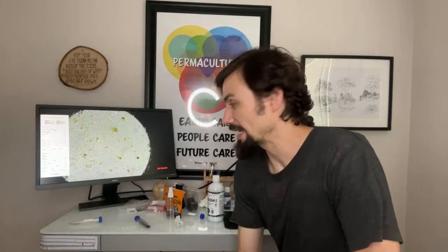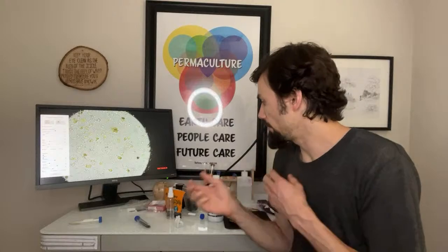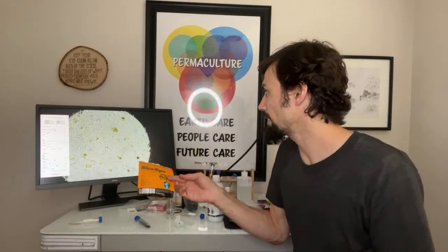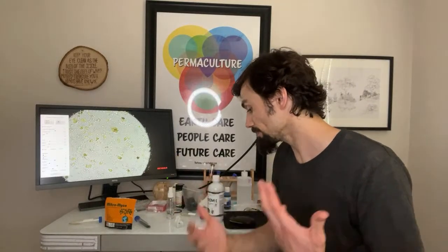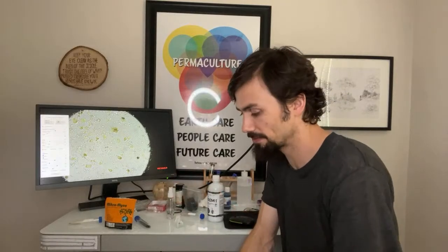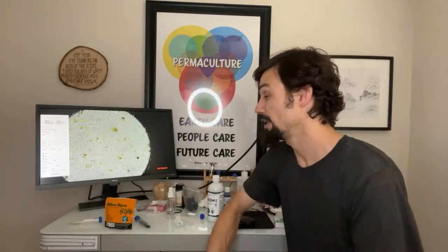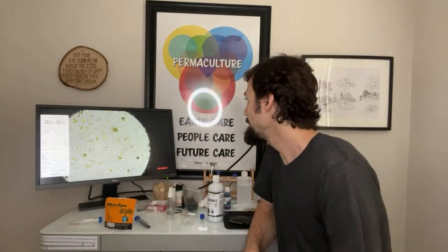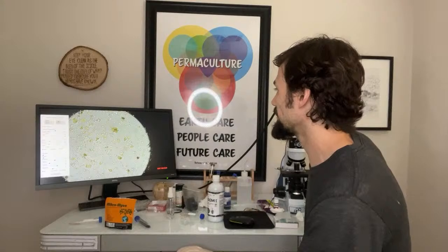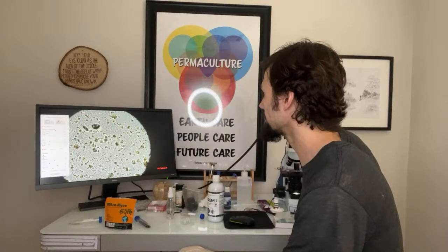What I've found in testing with seeds and the trials I'm doing with inoculation to create images of inoculants inside roots, micro is the least effective. So, and that's just my review. This is just a sample I have of their stuff. I've not tried endless samples of their stuff. And it might have even been resold by people, because, you know, people resell things, and so maybe they've been old, I don't know. But I don't see any spores, and spores last for like ever. I mean, there are spores, but you know what I'm saying, comparatively, it's nothing.